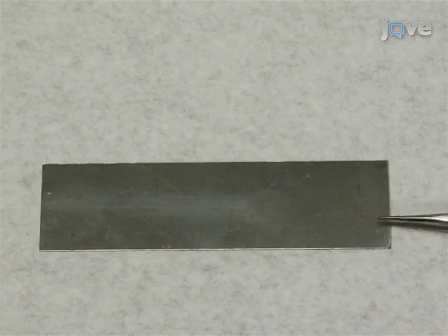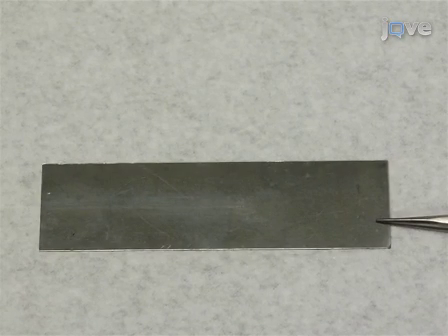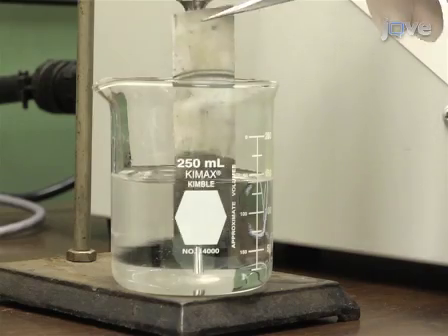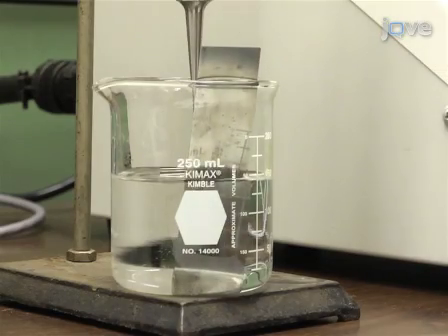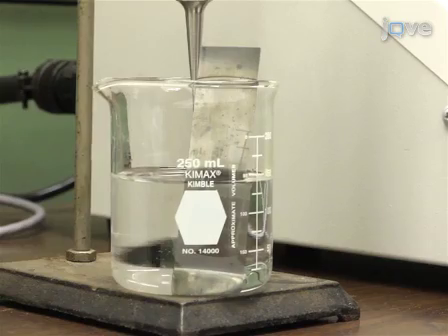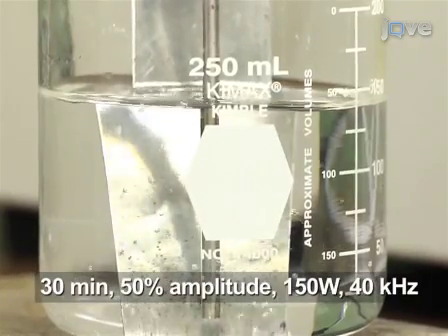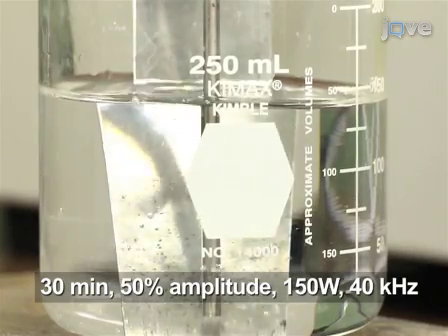Cut a 0.3 mm thickness molybdenum sheet into a 25 mm by 100 mm rectangle. Using an ultrasonic dismembrator with acetone and ethanol, remove the surface contamination for 30 minutes with a 50% sonicating amplitude, 150 W output power, and 40 kHz frequency.